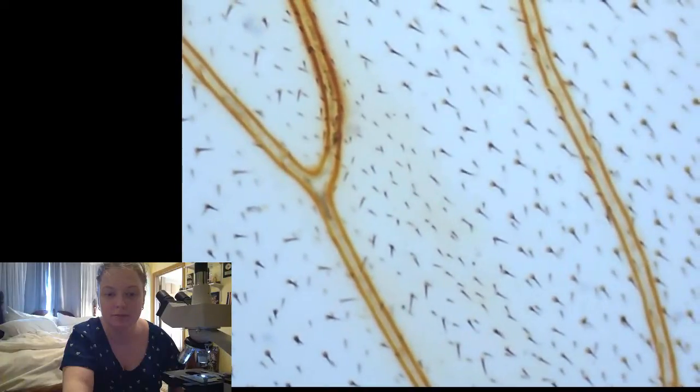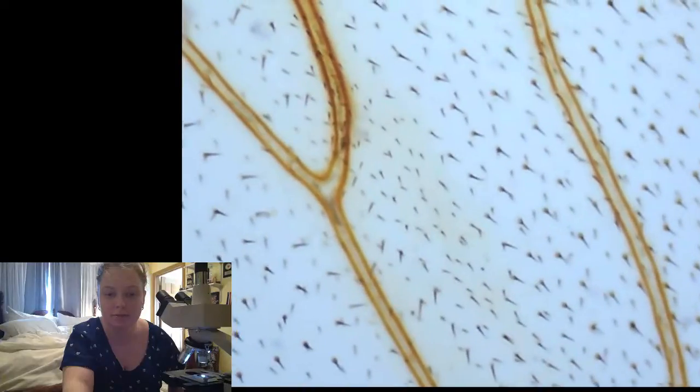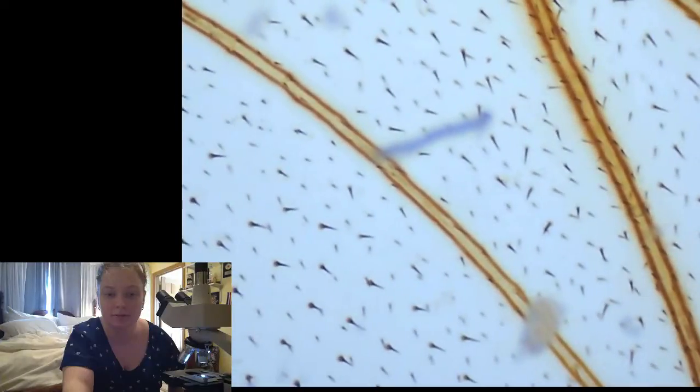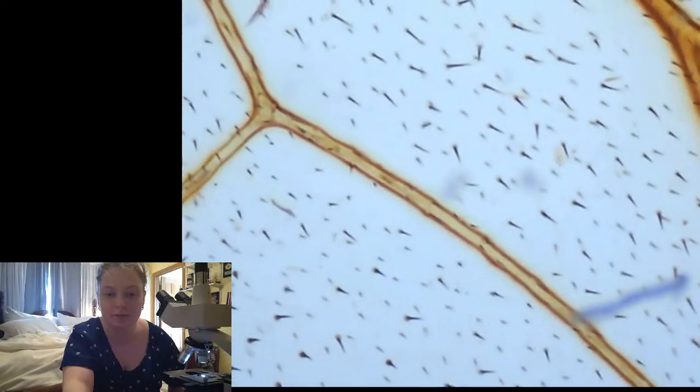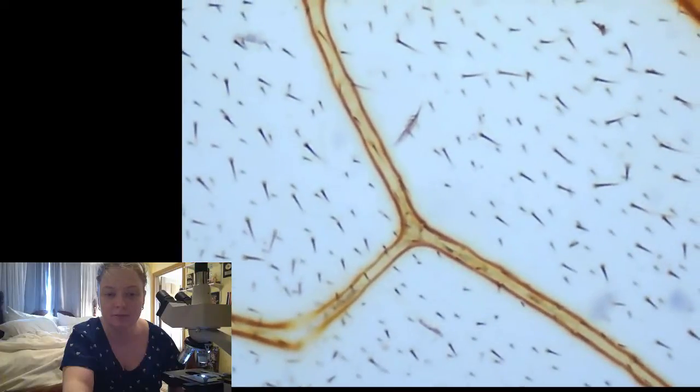This is neat. I really am obsessed with these little kind of spiky bee thorns on its wing. This is super cool. Okay, last wing.